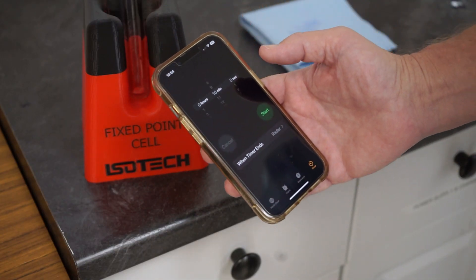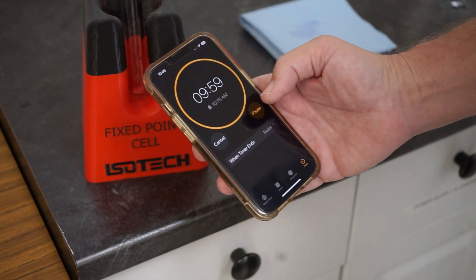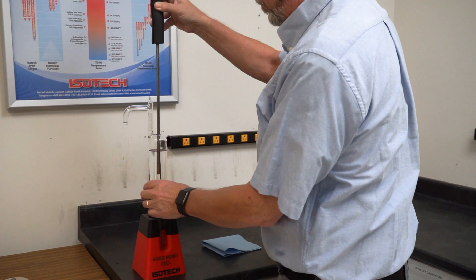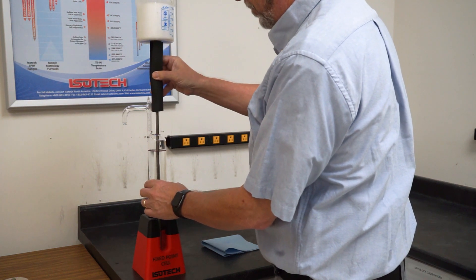Afterwards, set a 10 minute timer while the acetone evaporates. Once the acetone has completely evaporated, gently insert your ice mantle maker into the triple point of water cell.